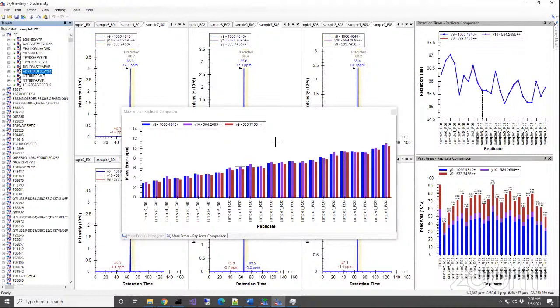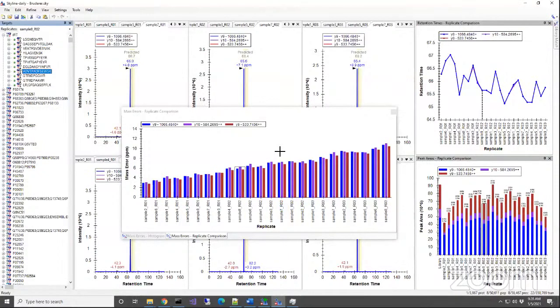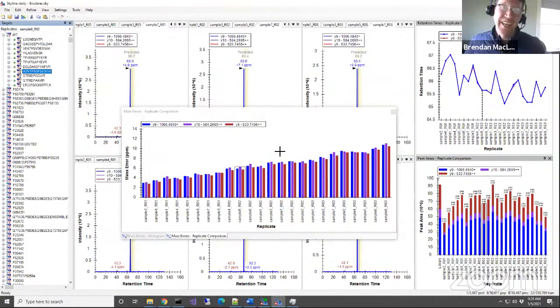There's actually a follow-up question, which I was also wondering: can Skyline do recalibration based on peptide entities or something like that? It can and it should, but it doesn't. It's been on my list for years now. That's the sad thing. We do things where it's like, wow, that's been on the list for 8 years. That's one of the sad things about being on a project for 13 years: you can look back and say, huh, we realized we needed that in year 2, and we just finally did it.